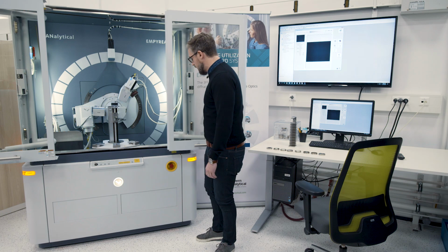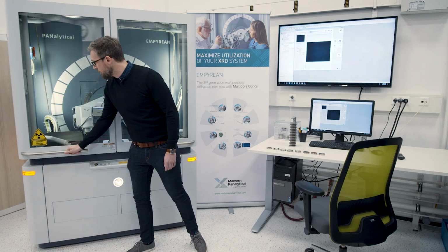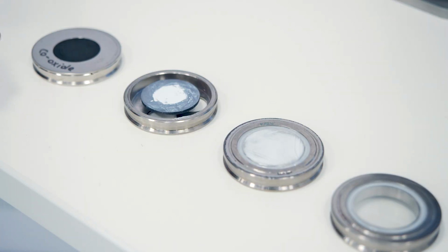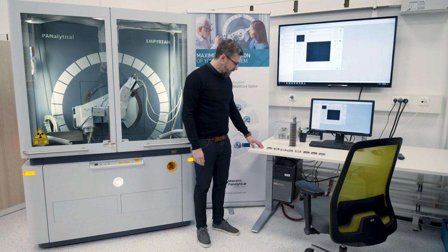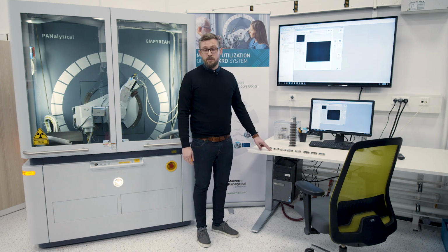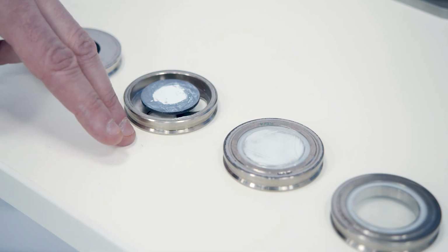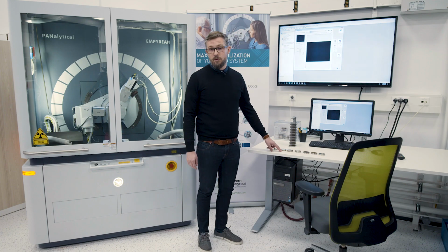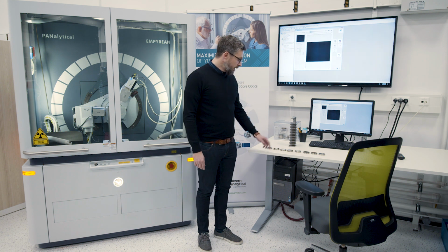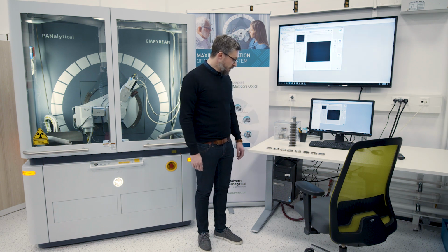Having said that, I would like to give you a very quick introduction to the samples that we will be measuring today. We will start with a powder sample of cobalt oxide, which is a very relevant compound in today's industry because it is used in battery production. After that, we will be measuring silver behenate, which is a metalloorganic compound on which we will demonstrate low-angle diffraction. After that, we will be measuring mesoporous silicate to demonstrate 2D diffraction at very low angles in transmission geometry.